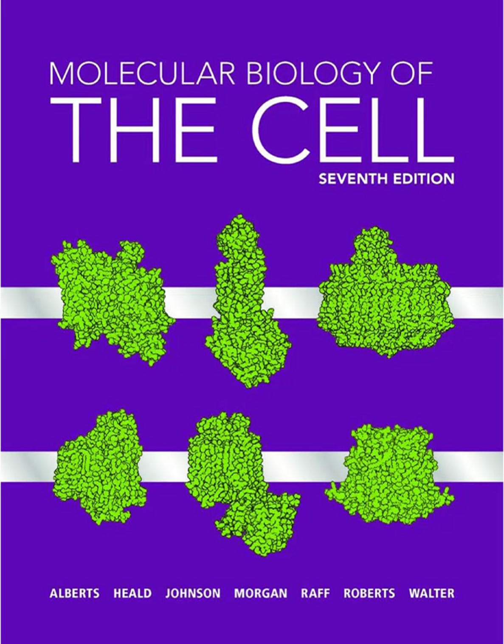Even more powerfully, if you have multiple copies of the same structure within the tomogram, like ribosomes or proteasomes, you can computationally extract them, align them, and average them together. Subtomogram averaging. Right. This averaging boosts the signal and can achieve resolutions of 1 to 2 nanometers, letting you determine the structure of molecular machines within their native cellular environment. It's a crucial link between cell biology and structural biology.